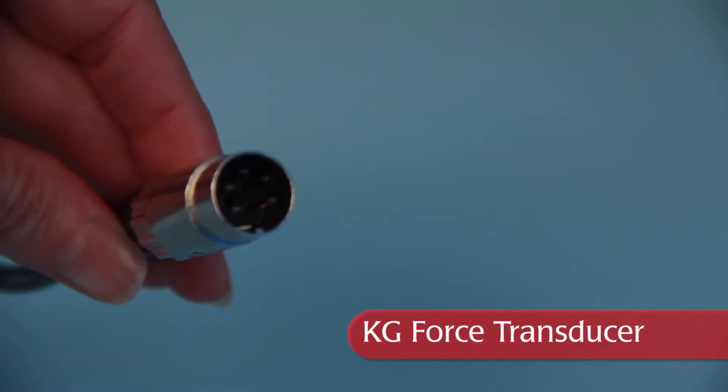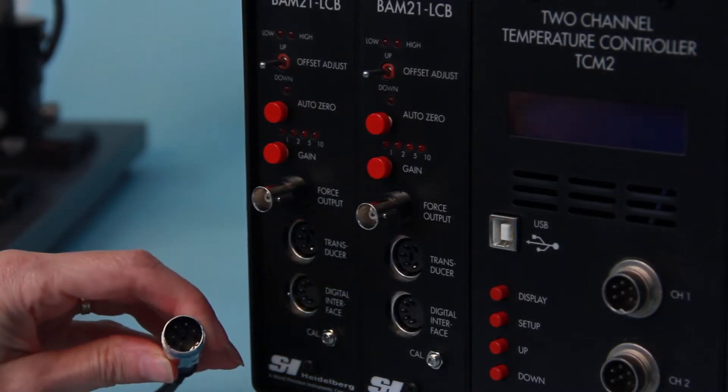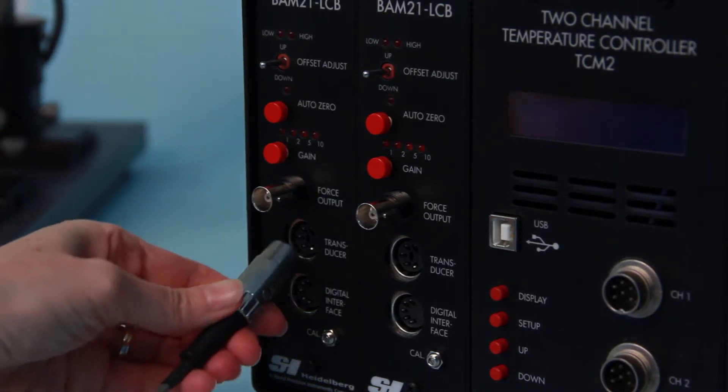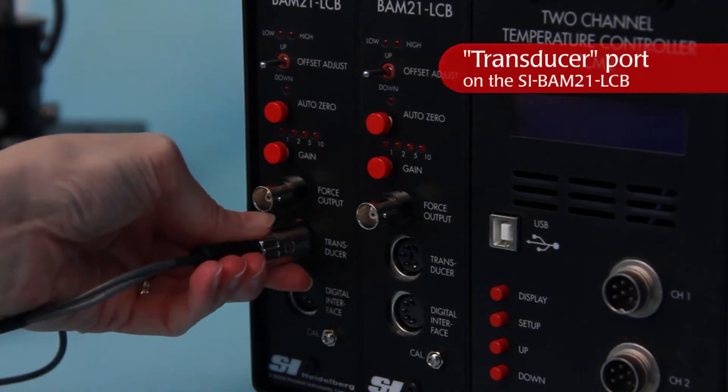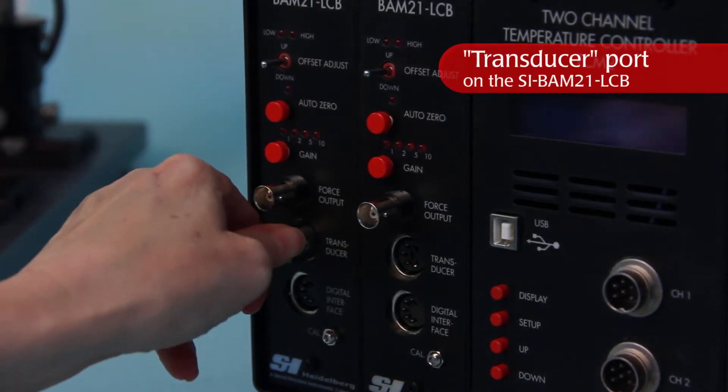That is for the two channel HTP system, micrometer or motorized MT or MKP platform. The KG transducer used with the muscle tester system has five pins. Line up the pins with the holes in the sockets, then plug the five pin connector of the transducer into the socket labeled transducer on the front of the BAM21 amplifier.